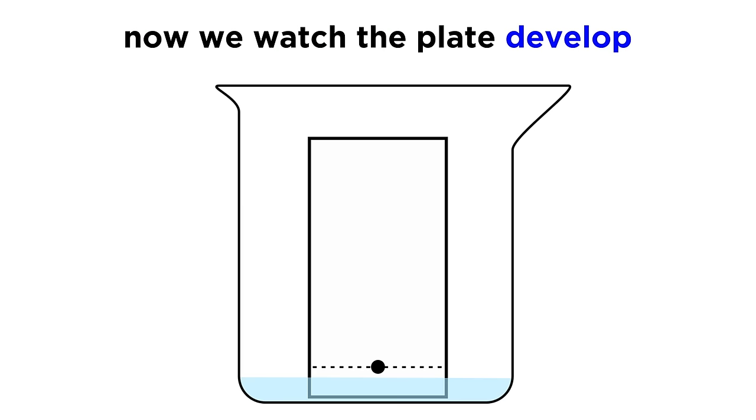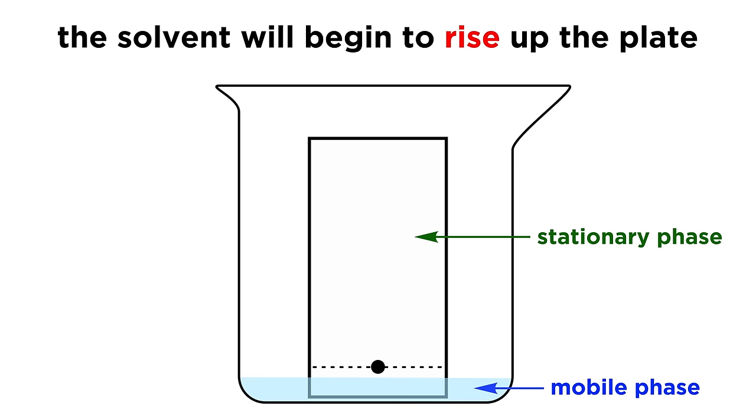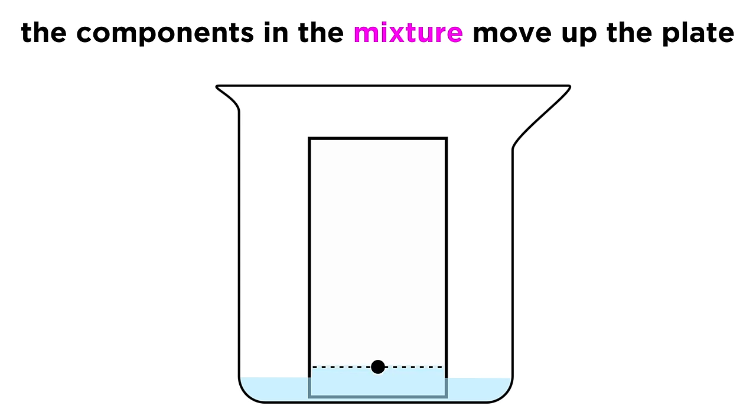Now cover the beaker with something so that solvent will not evaporate, and we can watch the plate develop. The solvent, which we call the mobile phase, will begin to rise up the plate, which we call the stationary phase. It does this by capillary action, just like we saw with the capillary tubes, and once it hits the sample, it will drag those components up with it.